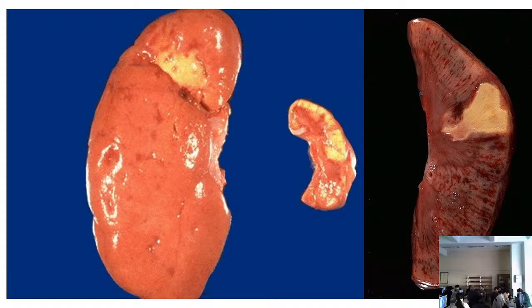A cardiac infarct many times is pale. Sometimes when we have re-entrance of blood, it may be hemorrhagic as well. Bowel infarcts are commonly hemorrhagic because there is increased adjacent circulation in the branches of the mesenteric arteries. So that was the renal infarct.